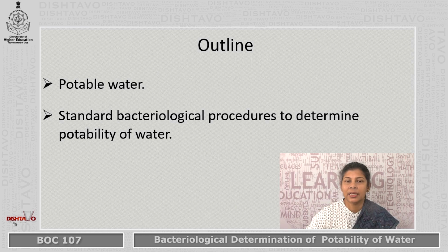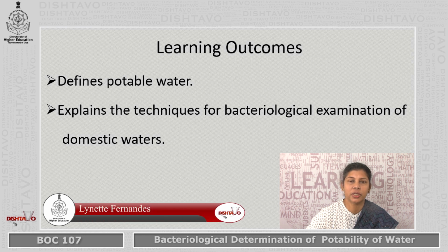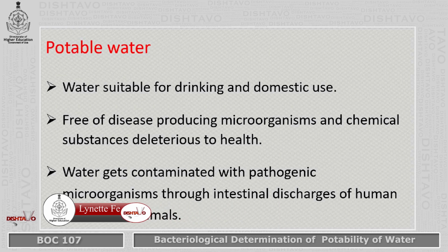Here we will be studying about potable water and also the standard bacteriological procedures carried out to determine the potability of water. What we will be learning here is the definition of potable water and also the different techniques for bacteriological examination of domestic waters. What is potable water?